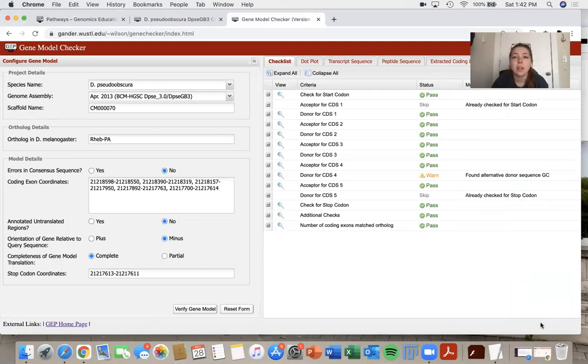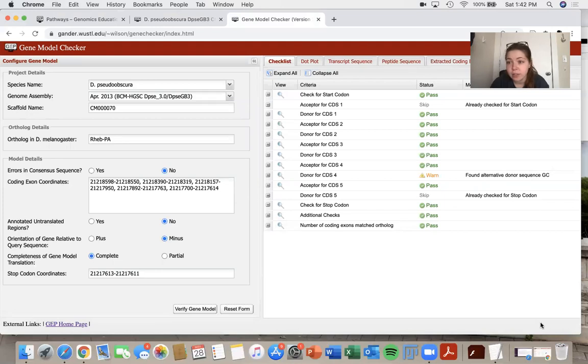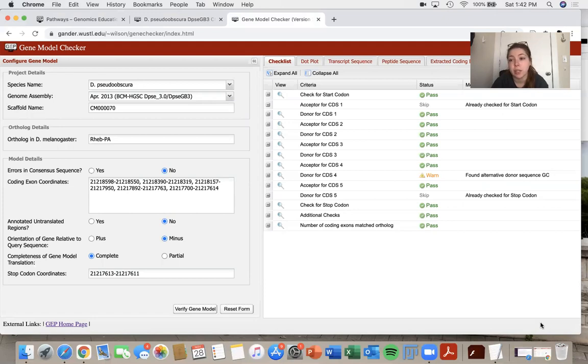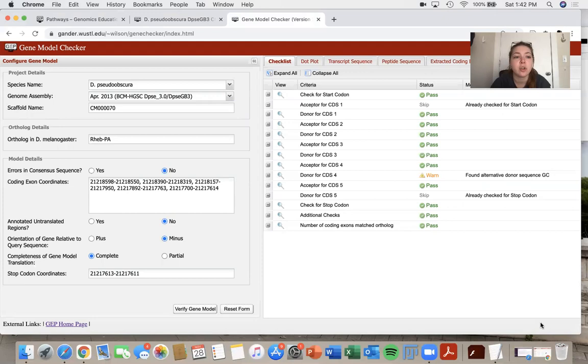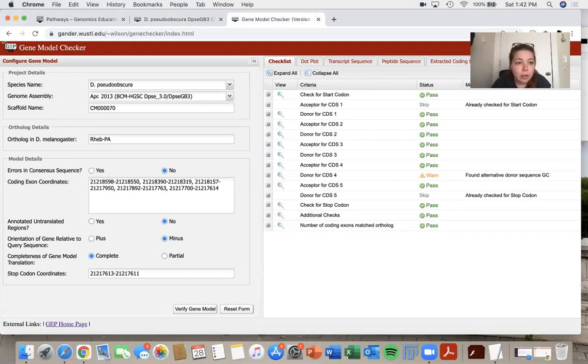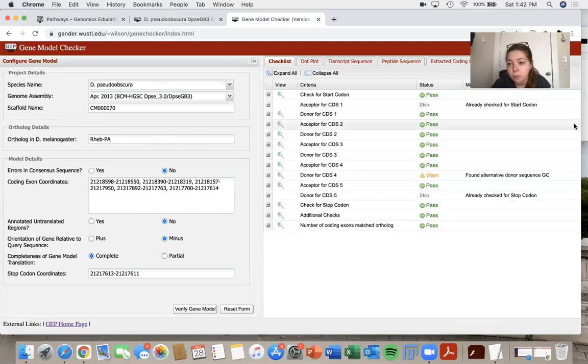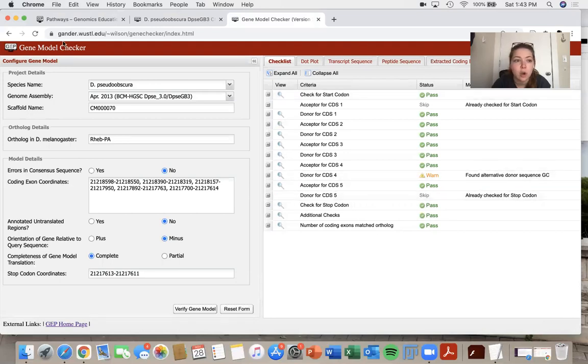So then what we need to do is we need to get images of various aspects of the gene model checker to put in our annotation reports. So what you'll want to do first is make sure you get a screenshot of the gene model checker. So make sure you kind of get all of this information in here, this whole box, including the checklist and all of the gene model information.